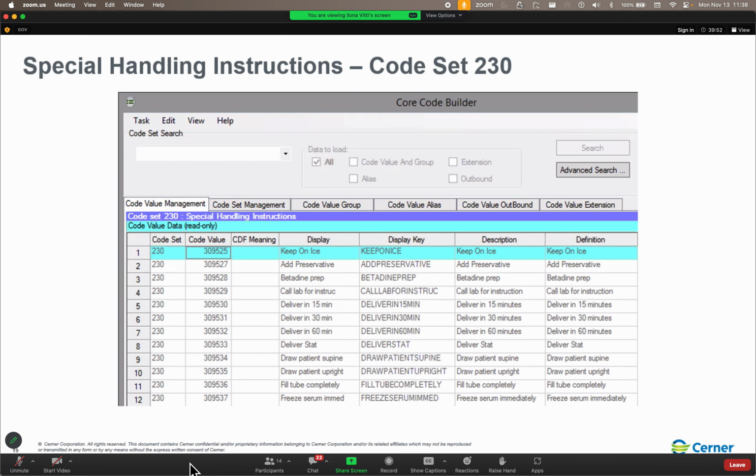So folks, this just circles back to, you really need to be comfortable with CCL, because that last one, you're not going to find it on the front end. The only place to find that information is on the netting table in the back end. So does anybody have any questions on accession netting? There's 4 parameters.